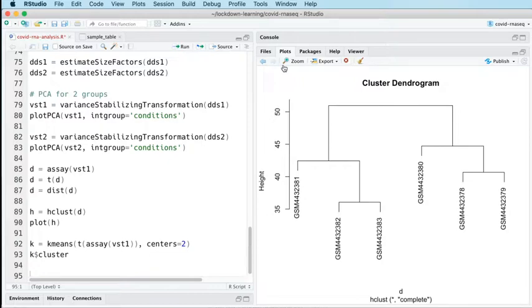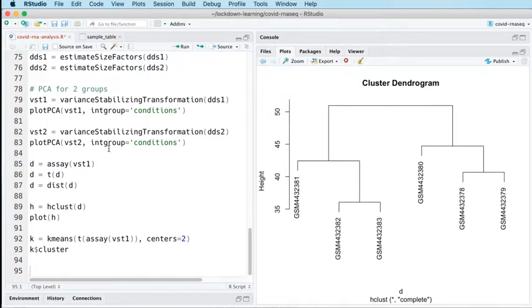We've got 2 more steps in DESeq to apply. We've previously estimated the size factors of our experiments, and we've got 2 other steps to take with DESeq: to estimate the variance of our experiments, so there's a function to do that, and then to apply some statistics. And then we're going to extract results. So we're going to pull our differentially expressed genes out of our DESeq dataset at the end. So that's the process for today.